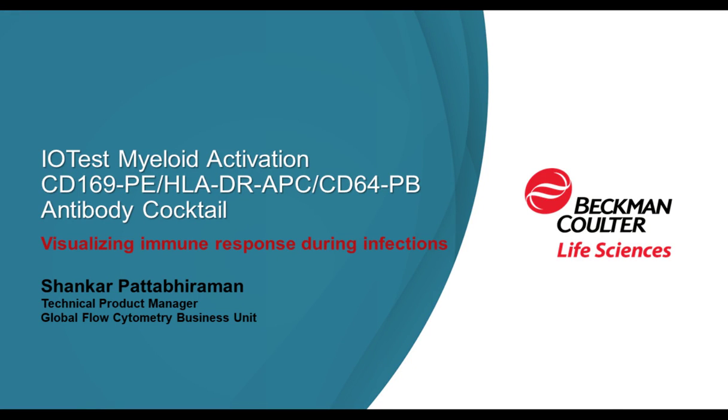Hello, everyone, and welcome to today's webinar, IOTest Myeloid Activation CD169-PE HLA-DR-APC CD64-PB Antibody Cocktail, Visualizing Immune Response During Infections.